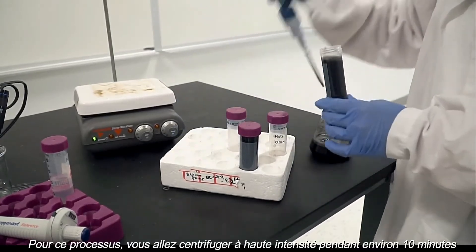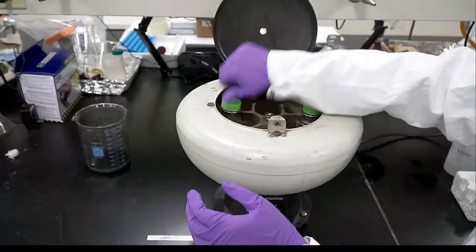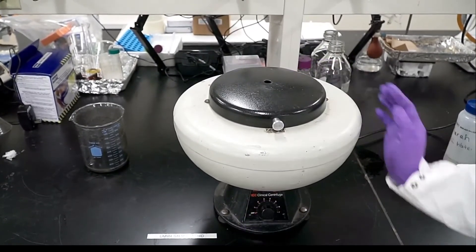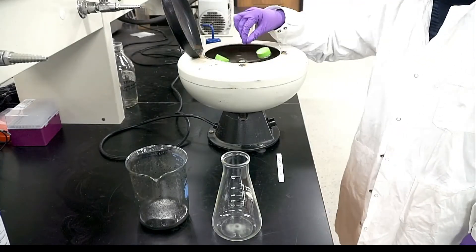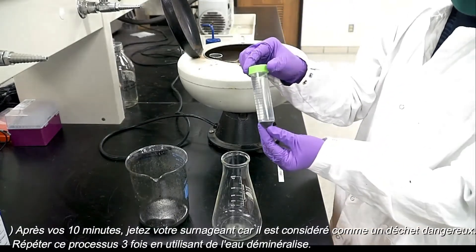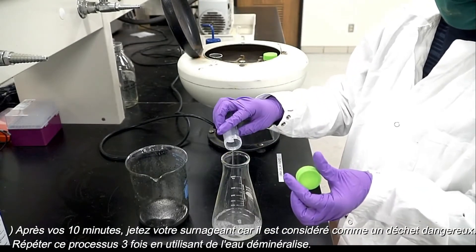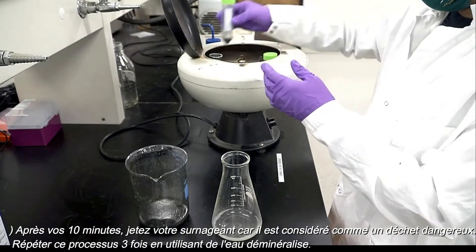For this process, you will centrifuge on high for roughly 10 minutes. After your 10 minutes are up, discard your supernatant as this is considered hazardous waste. You will repeat this process 3 times using DI water.